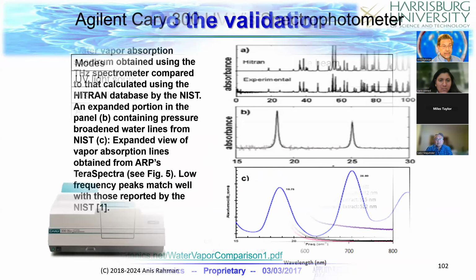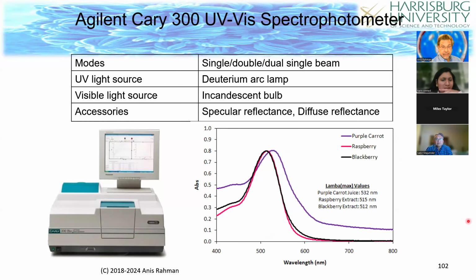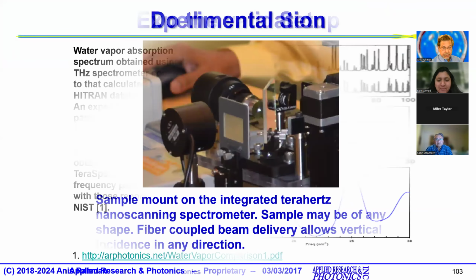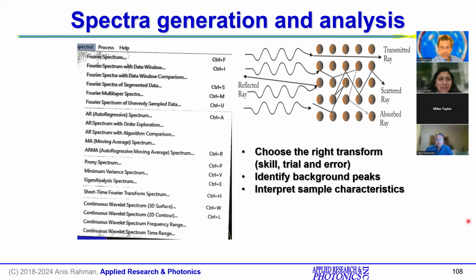And then, we talked about the diagram I showed just here, this one. This is the spectrometer. The spectrometer needs calibration, and calibration has been done with respect to water molecule, with respect to polyethylene molecule. I'm skipping because we have discussed this before.